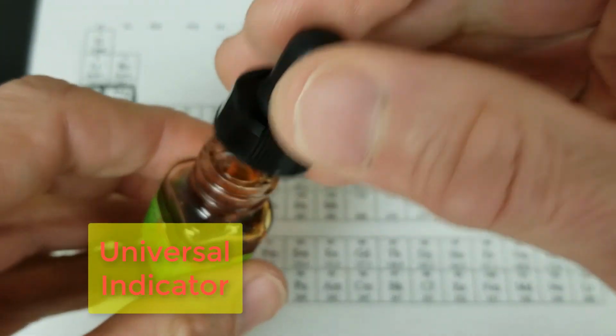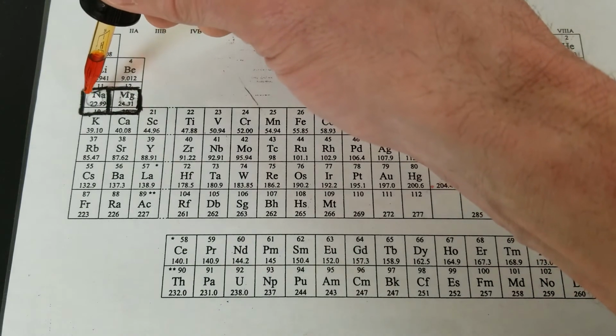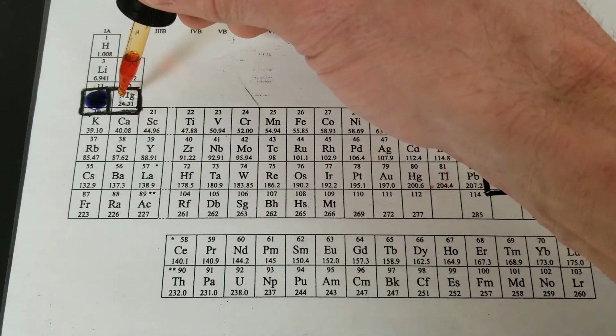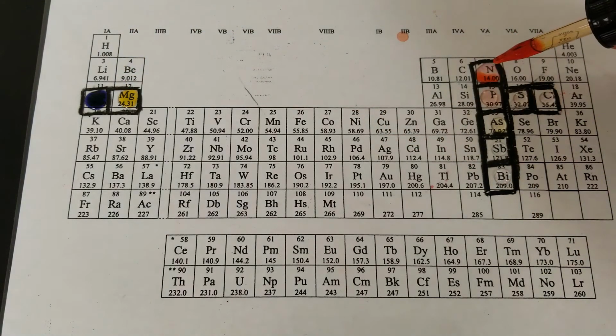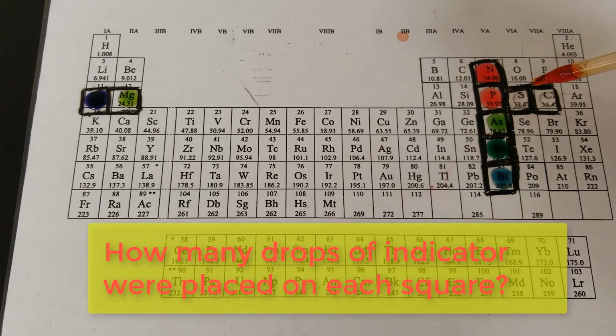Universal indicator. How many drops of indicator were placed on each square?